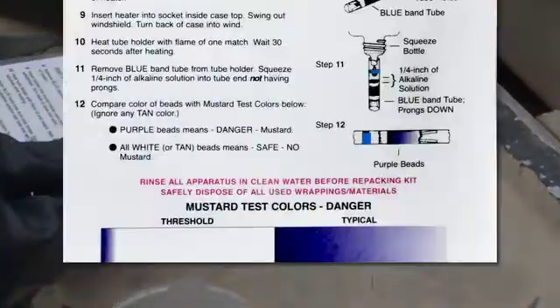Compare the color of the beads with the mustard test colors on the instruction card. You can ignore any tan color. Purple beads mean danger, mustard is present. All white or tan beads mean safe, no mustard is present.